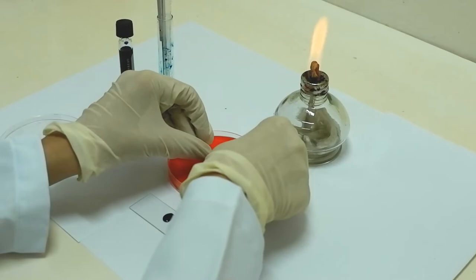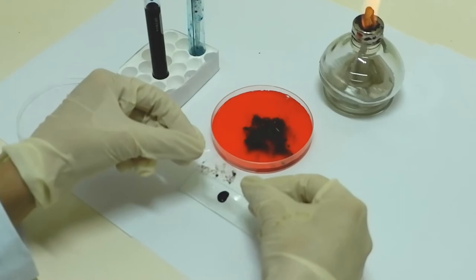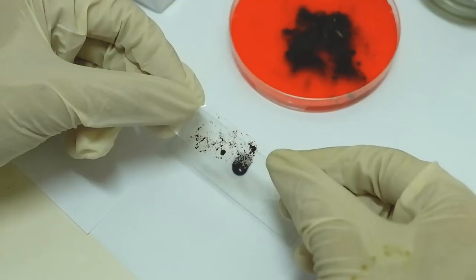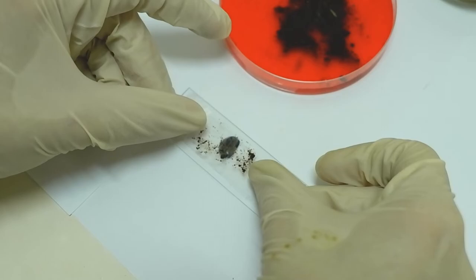Touch the sticky side on the top of a mature fungal colony to allow sporulation structures to stick to the tape.